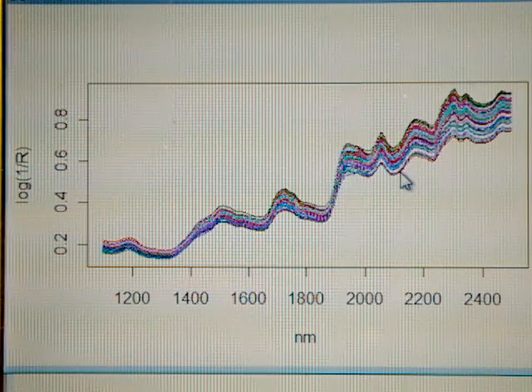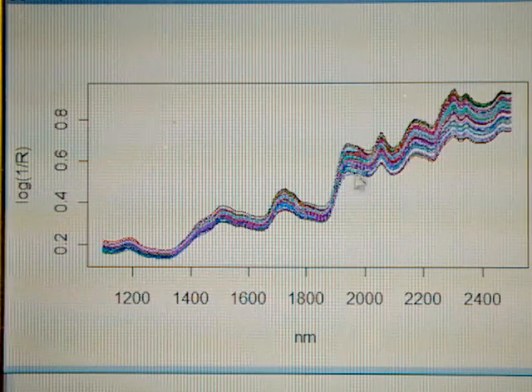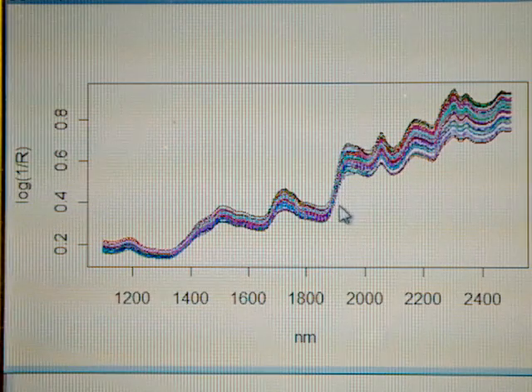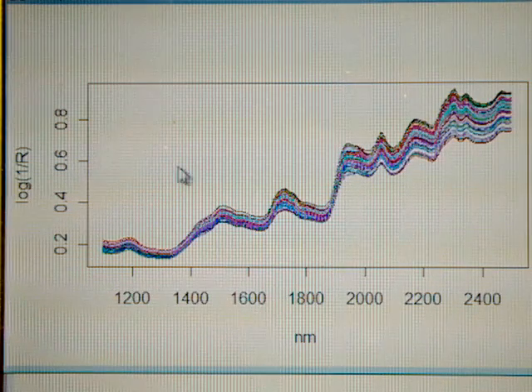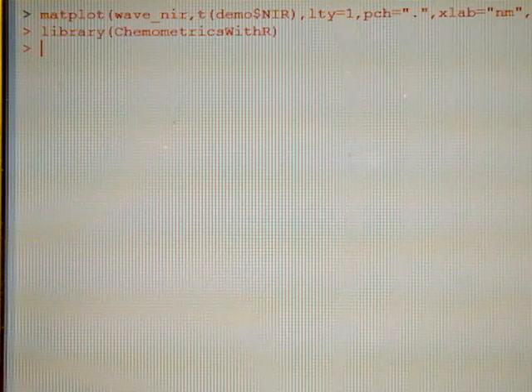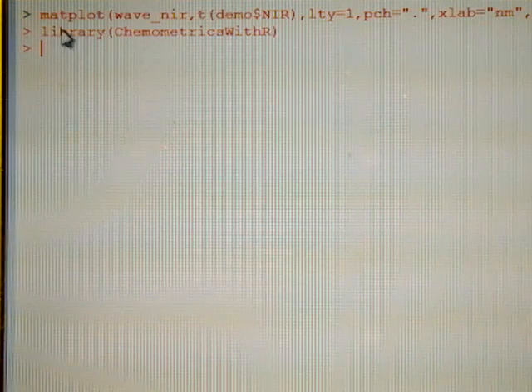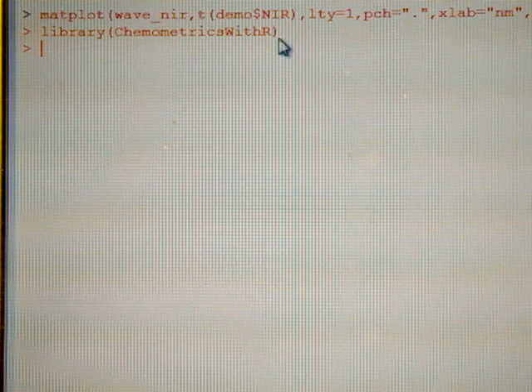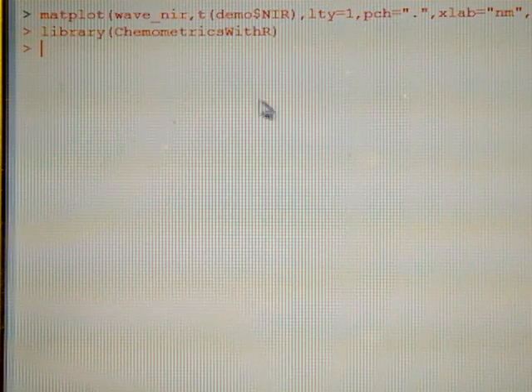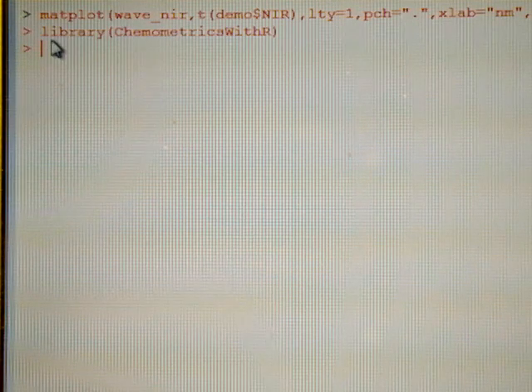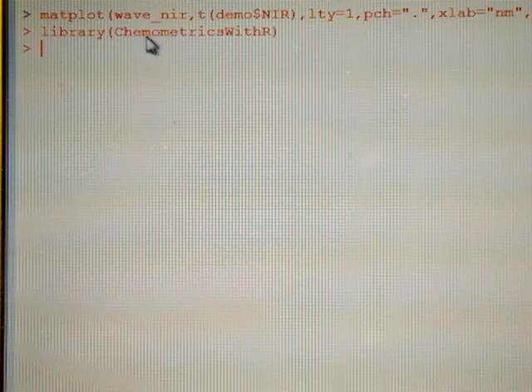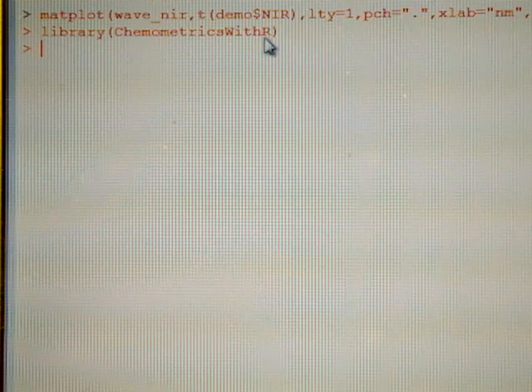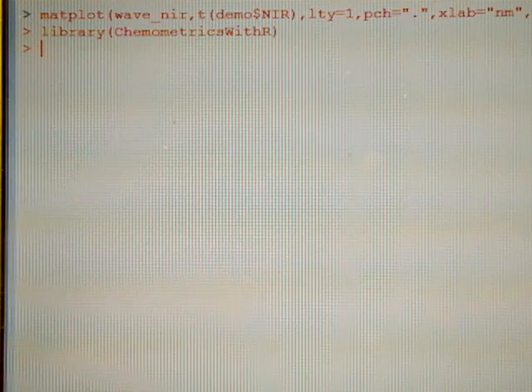So we have to treat this data, this spectra, in order to correlate virtually the different wavelengths and the laboratory data. Before to do that, be sure that you have installed the package chemometrics with R, available from R, and once installed you only have to write library chemometrics with R and it is working.